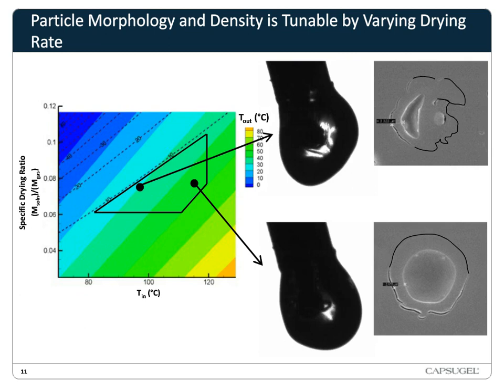And then the other side of that is fast drying, so that's on the bottom. When we dry really fast, we get these very fluffy, hollow spheres, generally with a smaller wall thickness and lower residual solvent. The morphology of these can be seen on the lower right, which is a hollow particle, spherical in nature, and with a lower wall thickness.